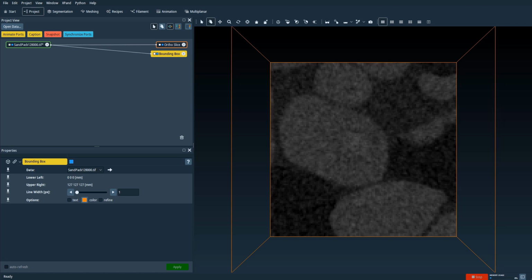Okay, so the next thing that I wanted to show you is how to interact with our 3D viewer here. To help us with that, we have a bunch of icons on top that help us interact with the viewer. You have your typical translation, zoom, and rotation here. What I find myself using most of the time is this trackball option. It allows me to quickly do rotation, translation, and zooming using my mouse.